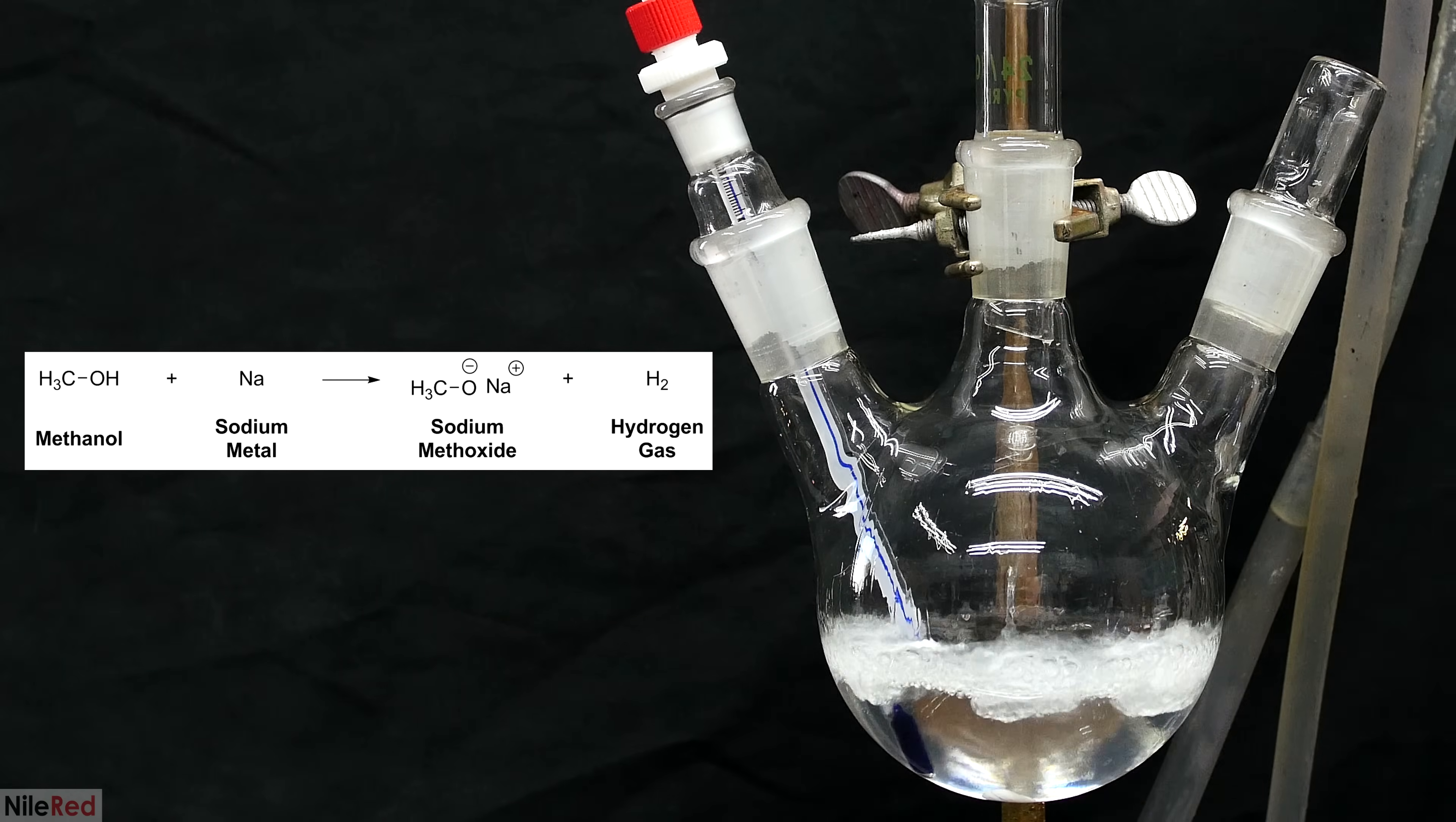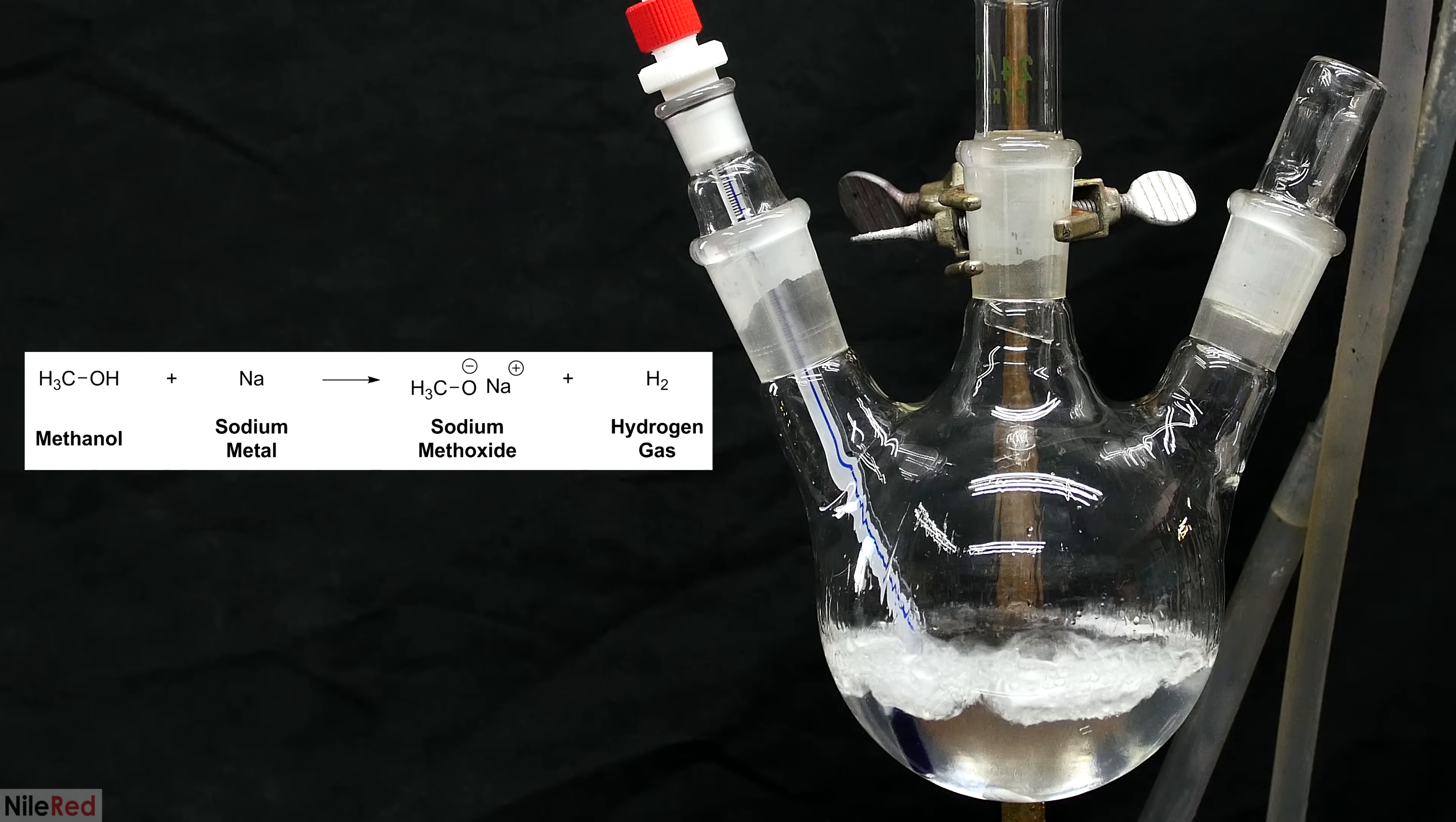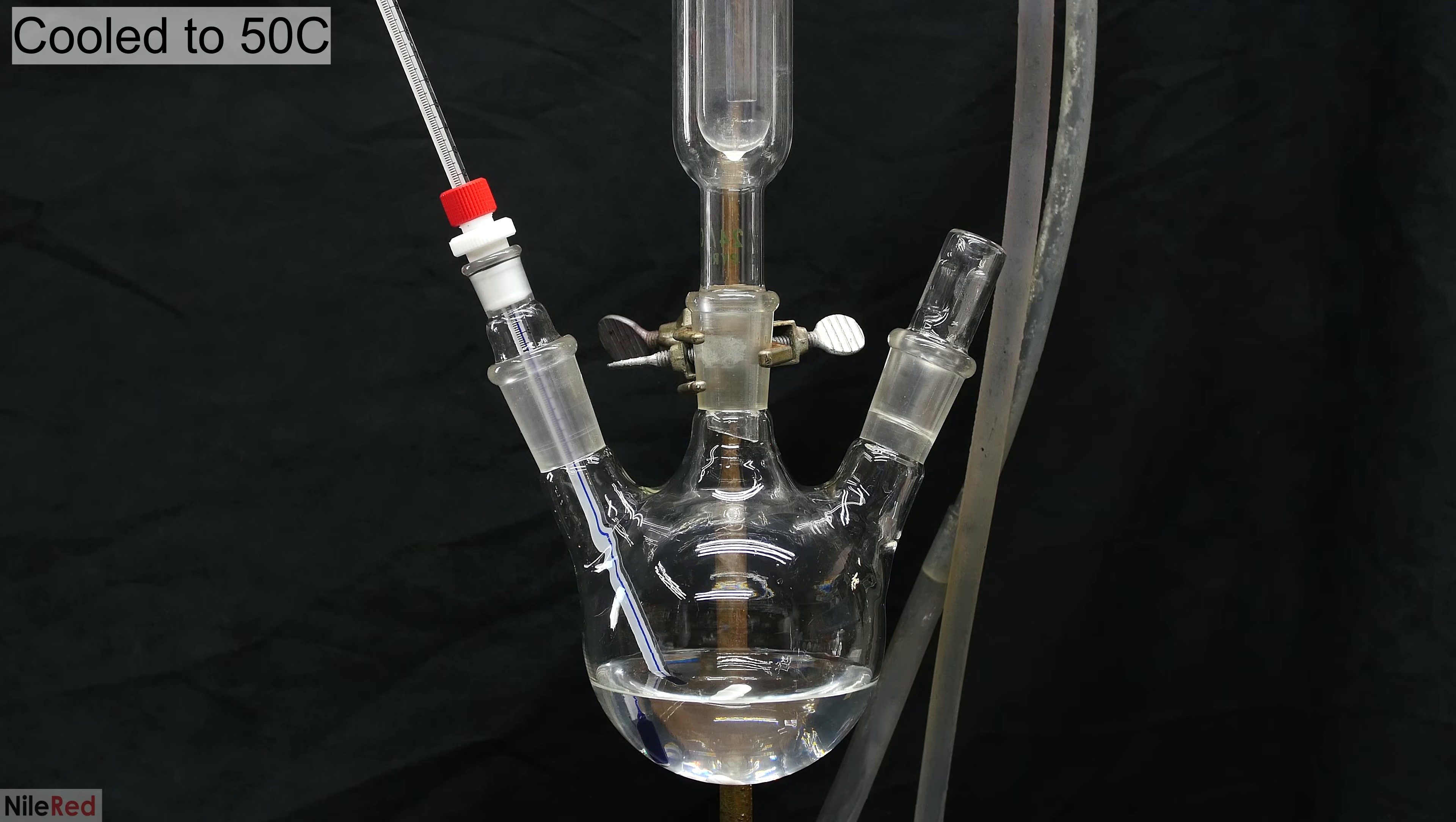Anyway, what we're doing here is reacting the sodium with the methanol to form sodium methoxide and hydrogen gas. The hydrogen gas bubbles away, and this leaves us with just sodium methoxide, which dissolves into the methanol. After several minutes, everything should be done reacting. This methanol solution is still pretty hot, so we let it stand until it cools down to below 50°C.